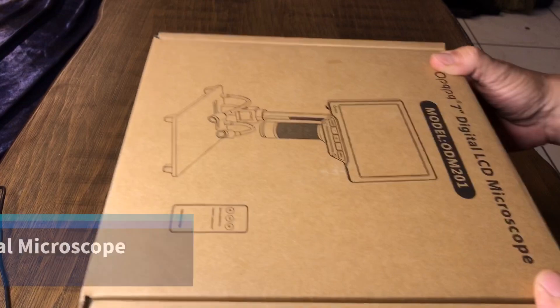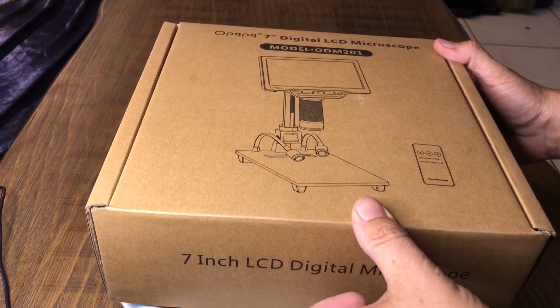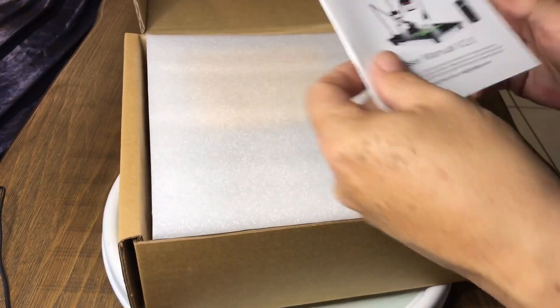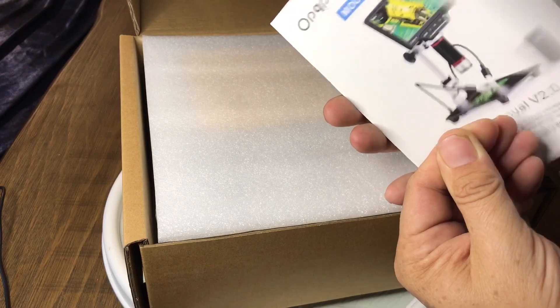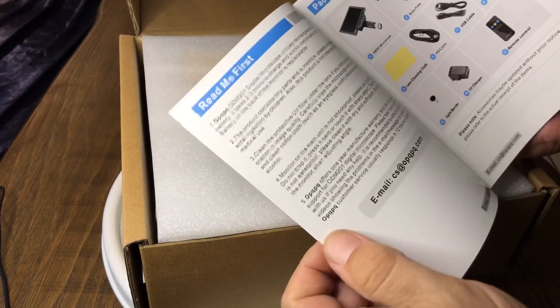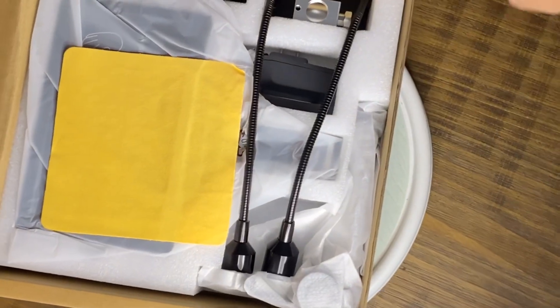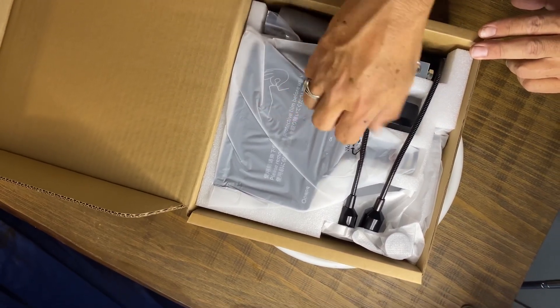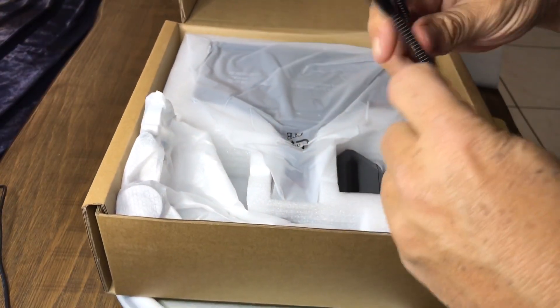We're going to unbox this and see what all is included. Let's go ahead and pop this open. The first thing we've got is a nice little user's manual version 2.0 — looks like it's all in English. Usually these are pretty straightforward. Some nice packing material and a cleaning cloth. Looks like we've got a couple of different things here.